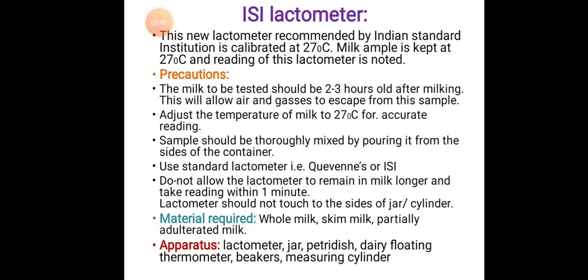Material required: whole milk, skim milk, partially adulterated milk. Apparatus: lactometer, jar, petri dish, dairy floating thermometer, beakers, measuring cylinder.